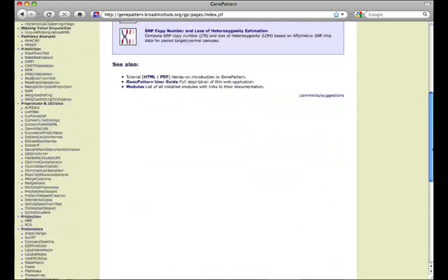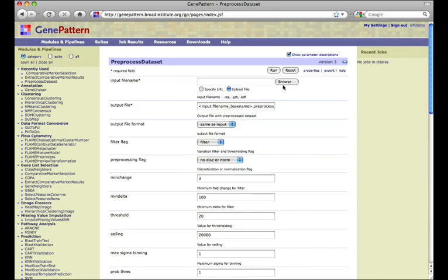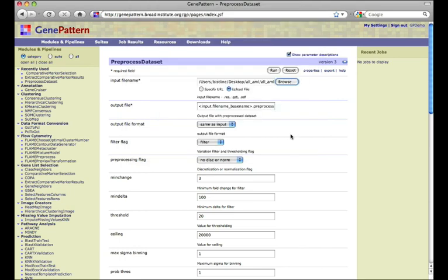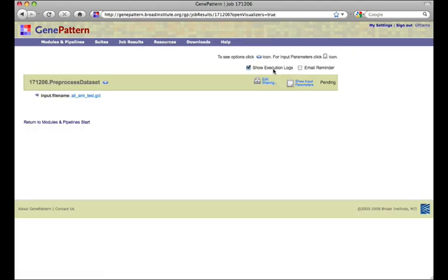To begin our example, suppose we have expression data and would like to determine the features that are most closely correlated with our class template, as well as the significance of that correlation. First, we run our expression data through preprocess dataset to normalize and apply thresholds to the data.